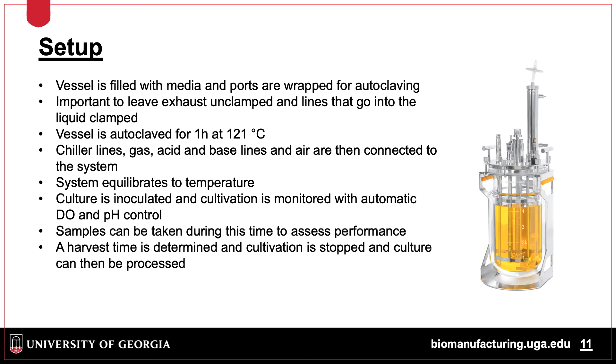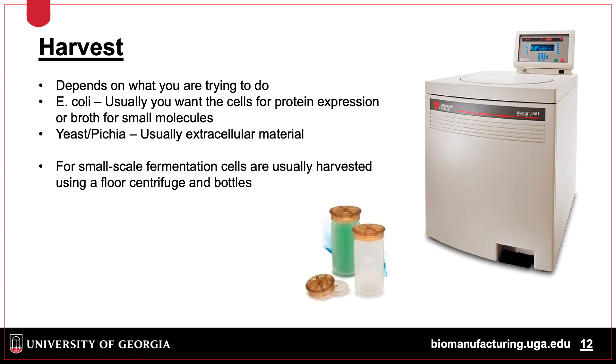To set up the vessel, first the system is put together and media added. Ports are wrapped in surgical paper, and lines that don't go into the liquid are left open, while lines that are submerged in the media are clamped to prevent liquid escaping during autoclaving. After autoclaving, the system is set up and allowed to come to temperature. A one-point pH calibration and two-point DO calibrations are performed. The culture is then inoculated, and cultivation is monitored until harvest time. Cells are harvested using centrifuge bottles and material kept for downstream processing.